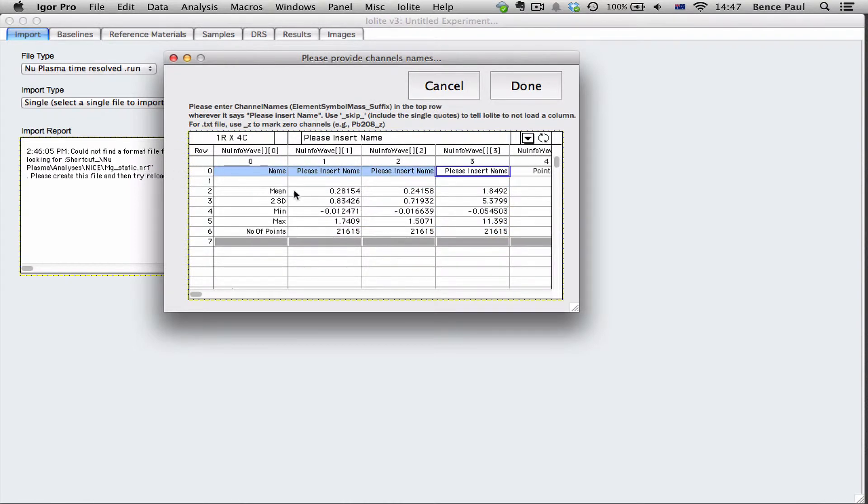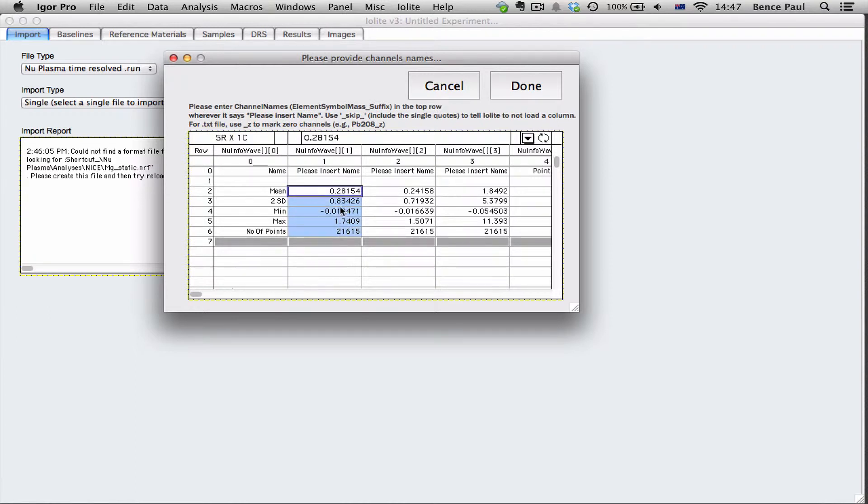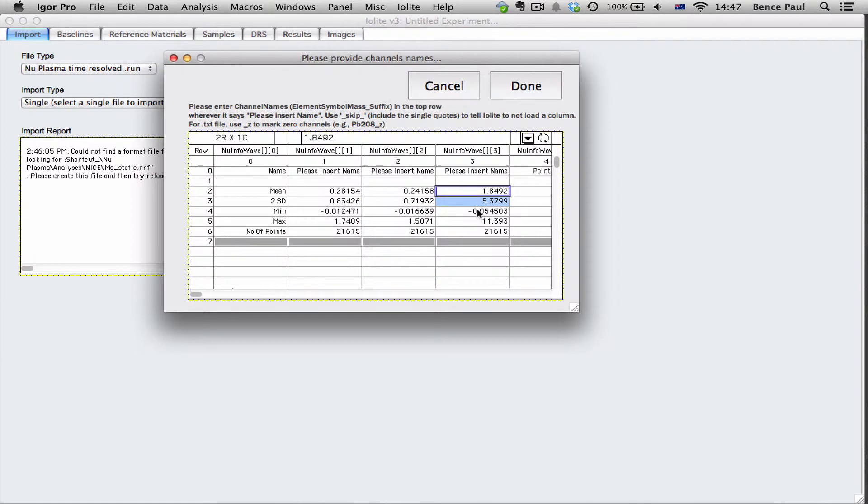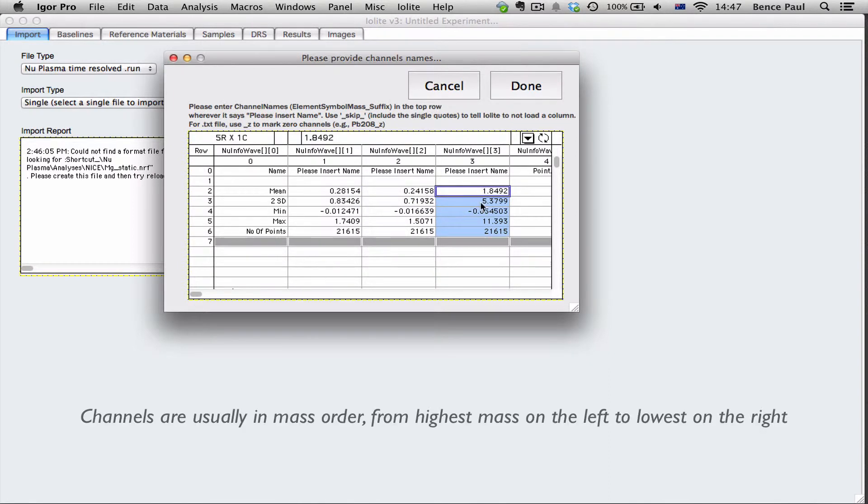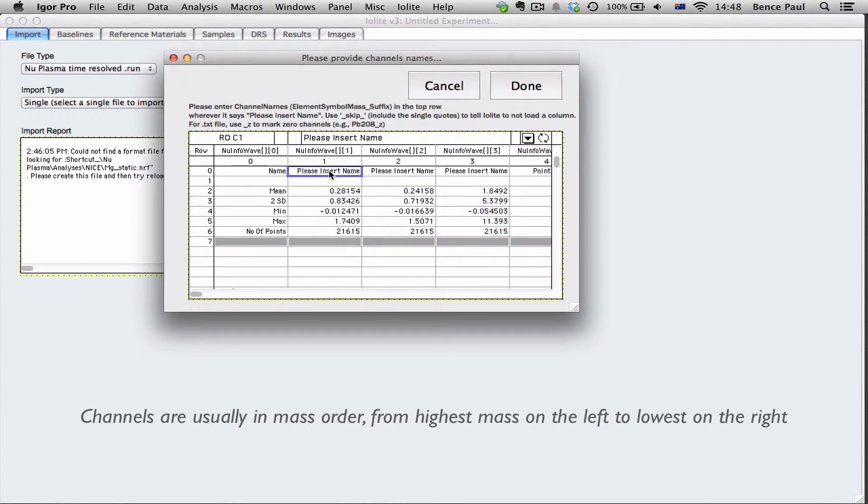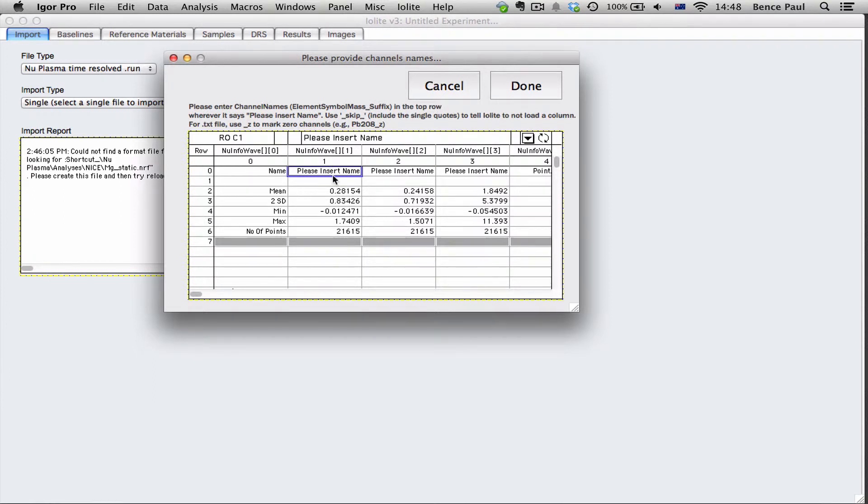And you'll notice that these last three here are automatically named because it automatically recognizes those. But these ones you can see it also provides a little bit of a few summary stats for the data in the file that we chose. And this is to help you recognize which isotope you're looking at. So in this case we know this is magnesium 26.